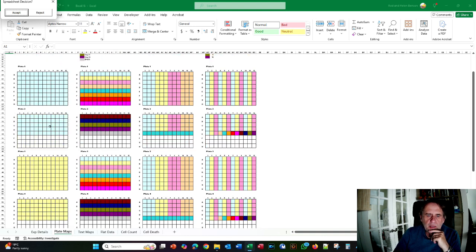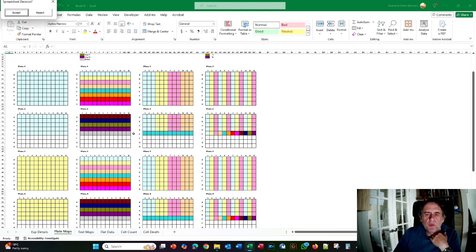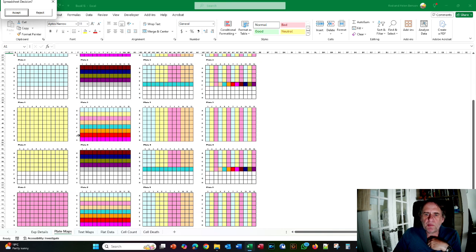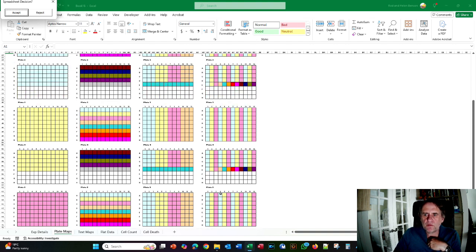When the first experiment comes to an end, the second experiment is now plated on a new plate, which is what we requested. The third experiment is plated on a new plate as expected. But now the way the platemaker wizard deals with this is it puts the plate controls for experiment 1 on the last plate of experiment 1, the plate controls for experiment 2 on the last plate of experiment 2, and the plate controls for experiment 3 on the last plate of experiment 3.